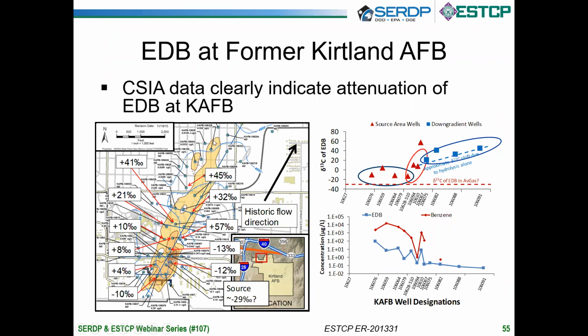And then we get into this longer part of the plume, we still see fractionation. And this, based upon the studies that were done for this project, is very consistent with what you'd expect due to hydrolysis over a period of many years or decades. So again, a slow process, but one that fractionates and one that you can see using stable isotopes.